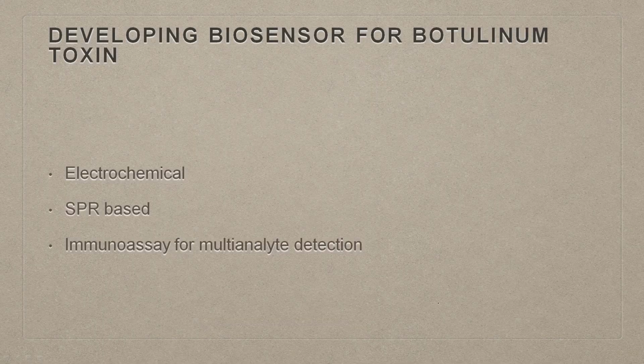In the previous class we talked about one of the electroactive sensors. Overall we have classified this part into 3 aspects. We have talked about the electrochemical sensor. Today, we will talk about the SPR based sensors and immunoassays for multi-analyte detection.